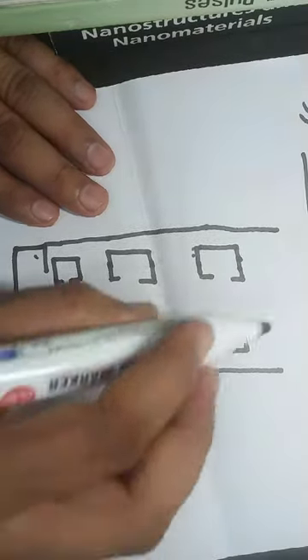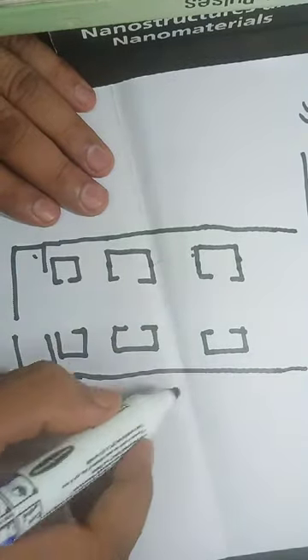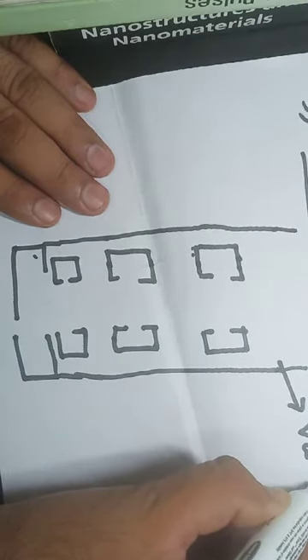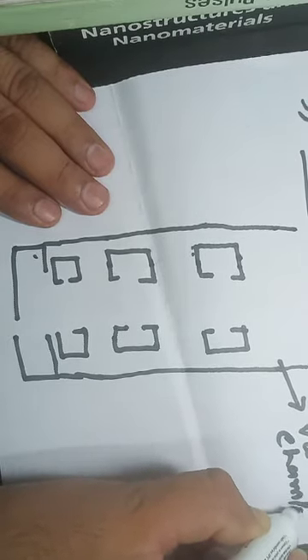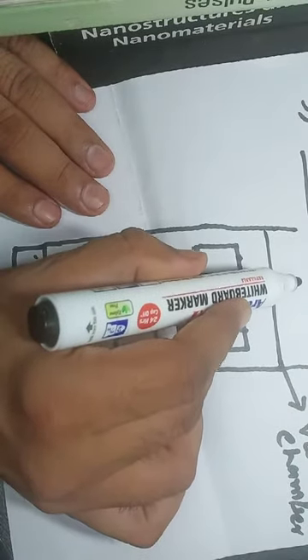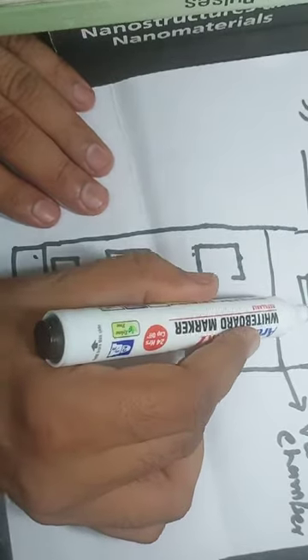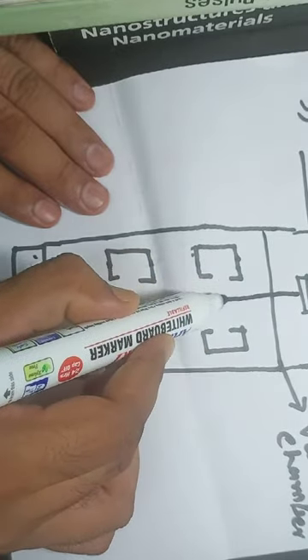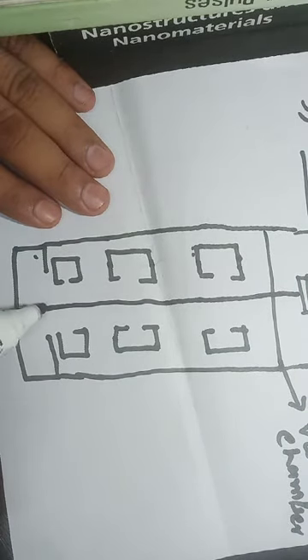Initially, this is a chamber, and this chamber is the vacuum chamber. You need to have the vacuum in this chamber. And from here you would have the electron gun, and this electron gun will give you the electrons. These electrons will come from here to here, and then they will be hitting the surface of the sample.